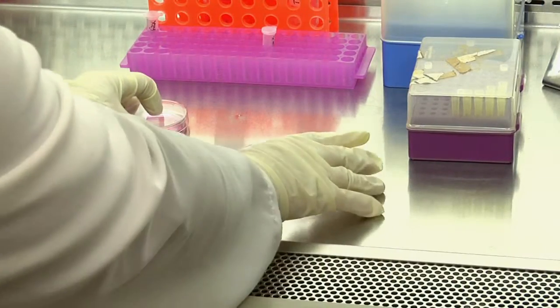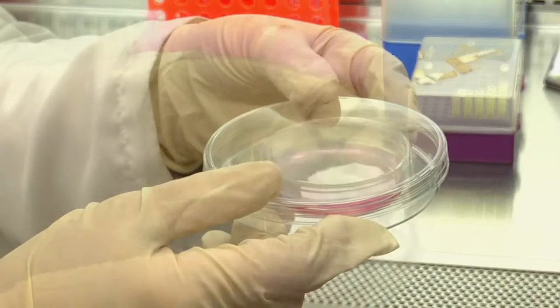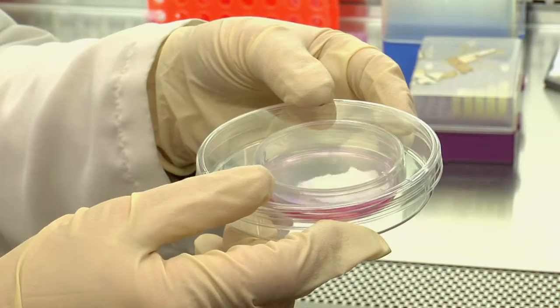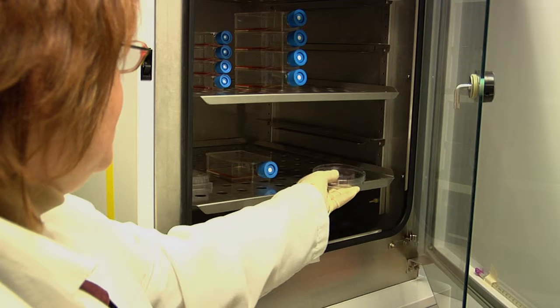Cultured dishes are usually placed in a secondary container to move them between the hood and the incubator and to keep them in the incubator. Make sure that you hold the containers flat while carefully bringing them to the incubator in order to avoid splashing liquid on the inside walls or lid of the primary container. Place the secondary dish inside the incubator with its content. Using a secondary container reduces the risk of contamination of cell culture dishes that, as you can see, do not have a tightly closed lid.